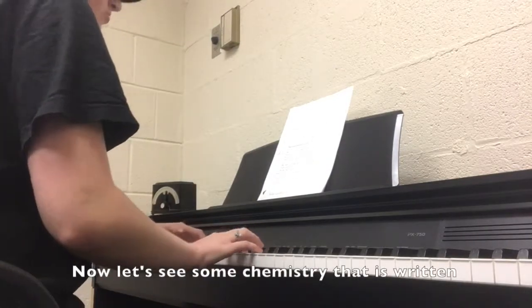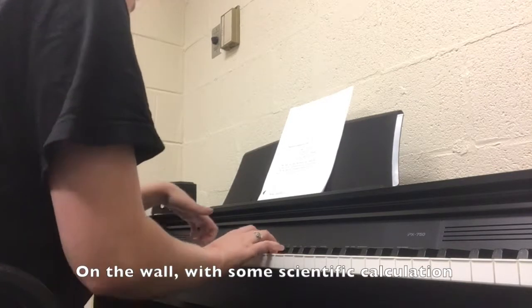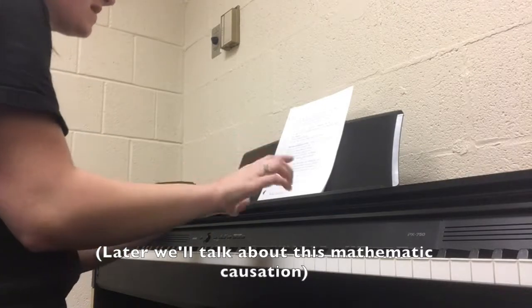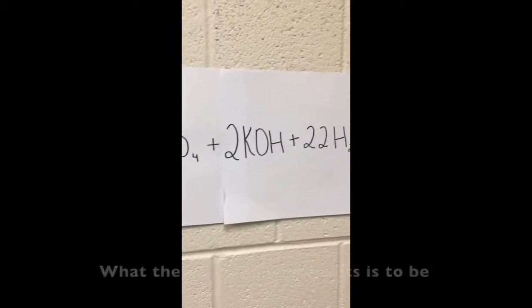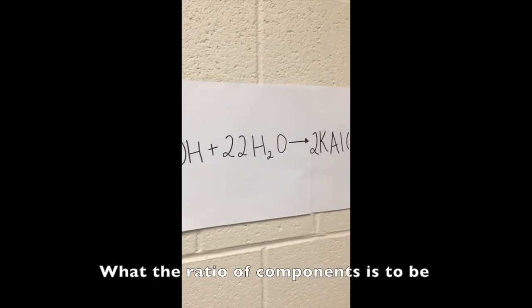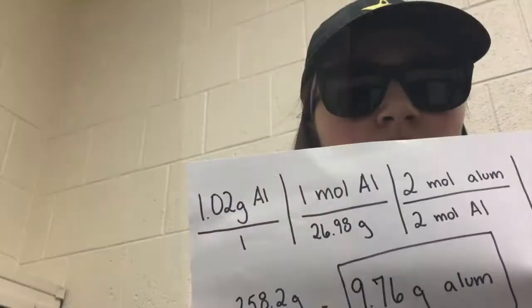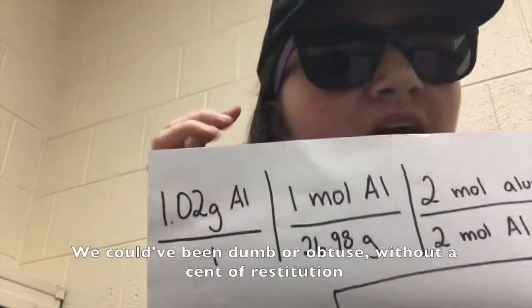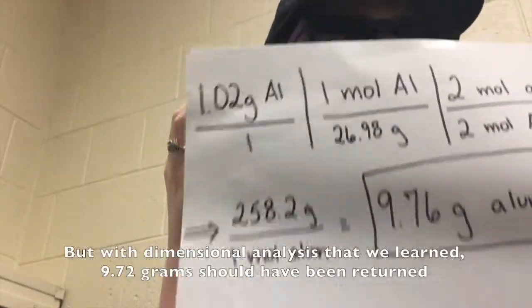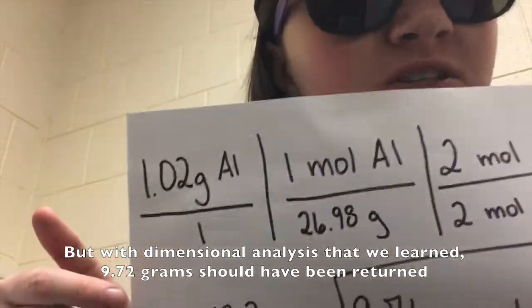Now let's see some chemistry that is written on the board with some scientific calculation. Later we'll talk about this mathematical equation. So first we use a balanced equation to see what the ratio of components is to be. With this equation for the entire reaction, we find the limiting reagent. With dimensional analysis that we learned, 9.7 grams should have been returned.